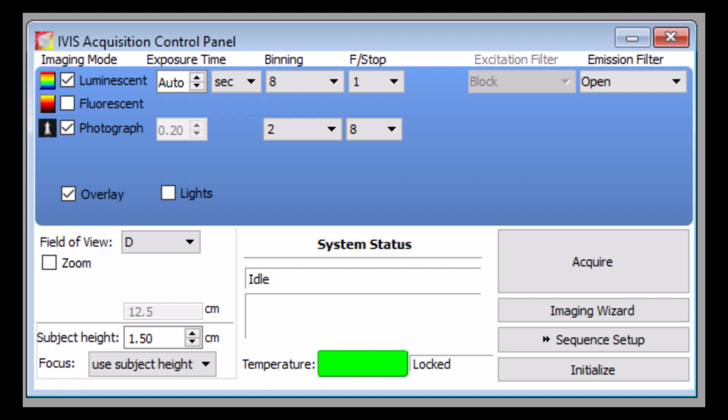Although you may choose to adjust the settings manually, a convenient auto setting is available that would choose optimal imaging settings for your particular acquisition. To access this feature, scroll down using the gray arrows beside the exposure time window. This tool safeguards against saturation or underexposure by automatically adjusting the exposure time, binning, and f-stop based on an initial reading of signal intensity. We highly recommend that you use this feature. Because changes in these settings are normalized for in the final calibrated unit, we encourage you to adjust these parameters throughout the course of the experiment.